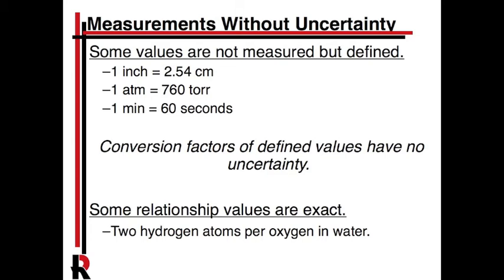Now, there are certain numbers we just don't have uncertainty on, and those are conversion factors. If we know that 1 atmosphere is 760 torr, it's exact. It doesn't have an uncertainty at all. The same is true with stoichiometry. If we're doing a stoichiometric ratio, which we'll have to do in this reaction, we produce 1 mole of oxygen for every 2 moles of hydrogen peroxide consumed, and that also is exact, so we don't have to add uncertainty there. The uncertainty then needs to come in with our measurements, things like mass, volume, all those sorts of things.